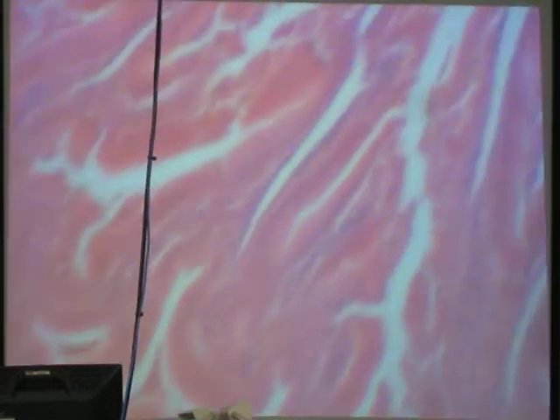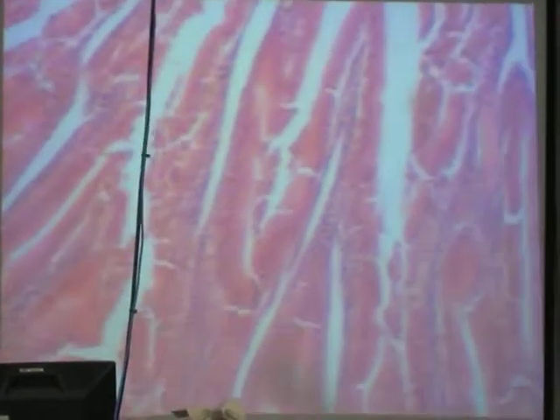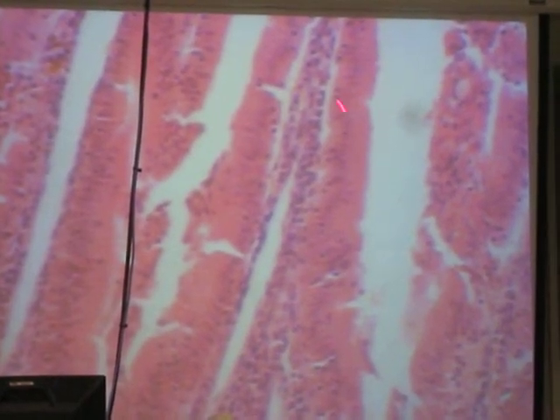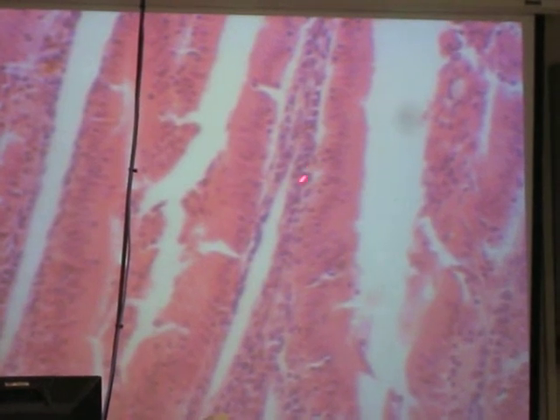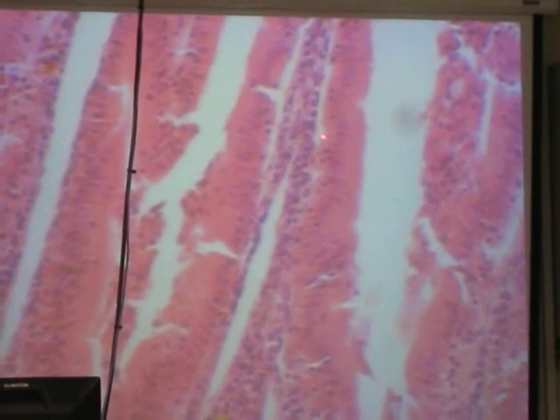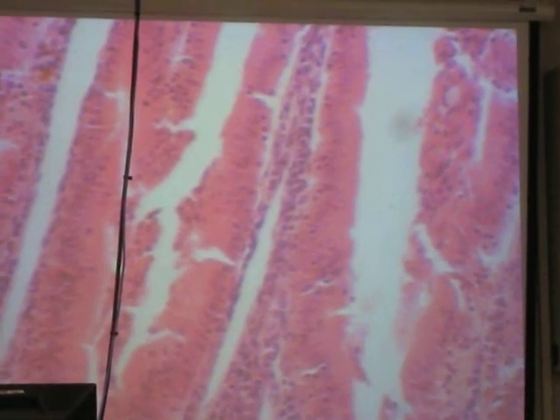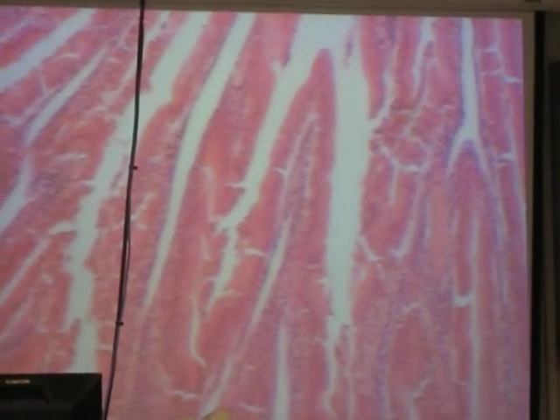You can also go out to the villi, the little finger-like projections, go up to high power and identify the mucosal tissue. Okay, your epithelium, simple columnar. All in the middle is your lamina propria. And then mixed in there, there's a few goblet cells as well. So the duodenum, you're going to be looking for those Brunner's glands more specifically.